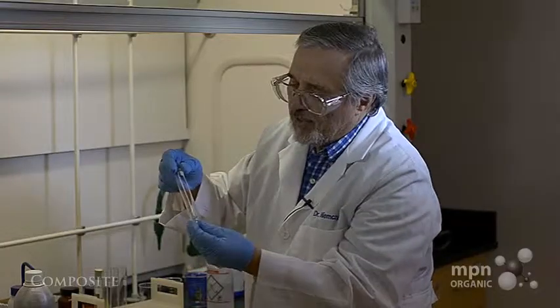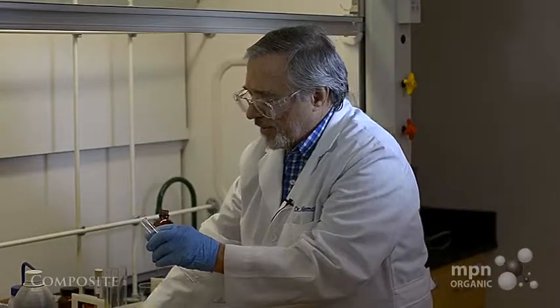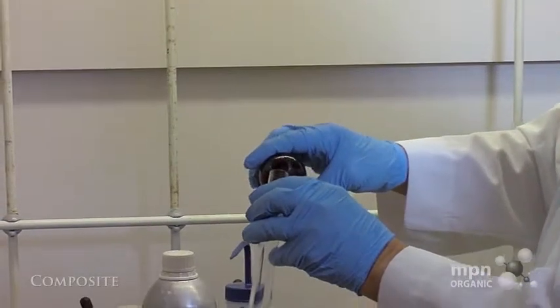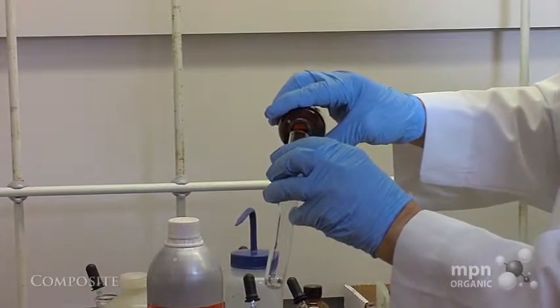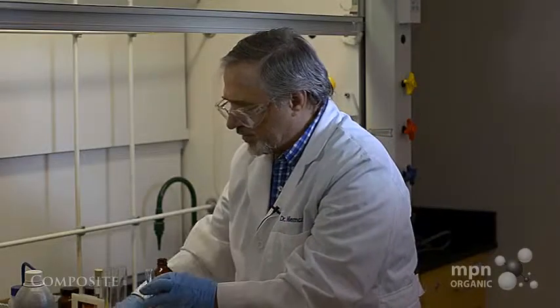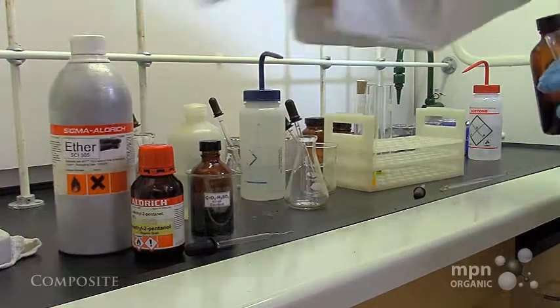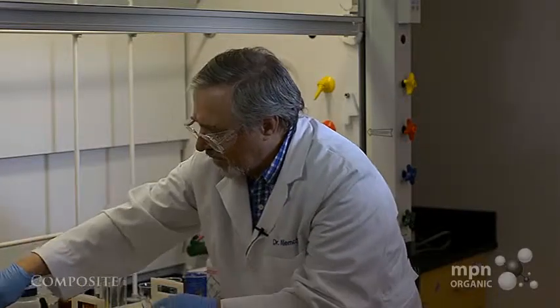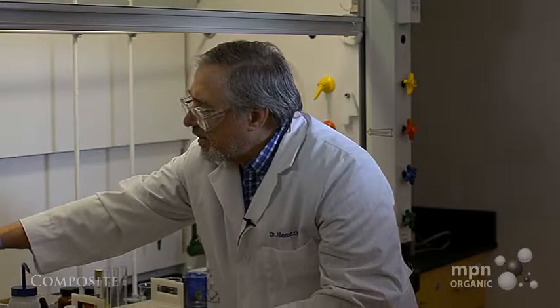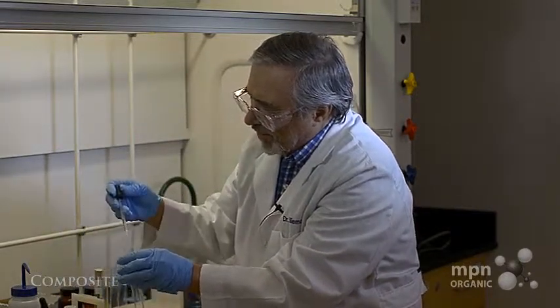Now remember, with the iodoform test, we use potassium iodide and iodine, and this is a very deep reddish brown liquid. Let's put just a little bit in there. We don't need too much. And if we add some sodium hydroxide to this, then hopefully we should see the yellow color of the CHI3 or iodoform.